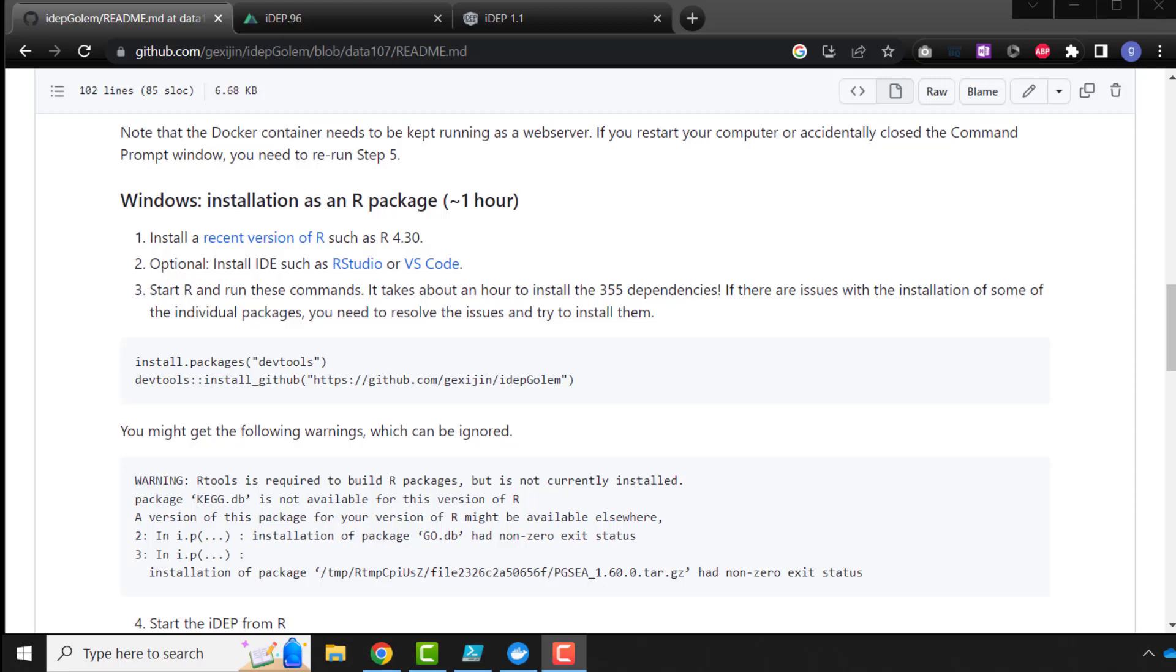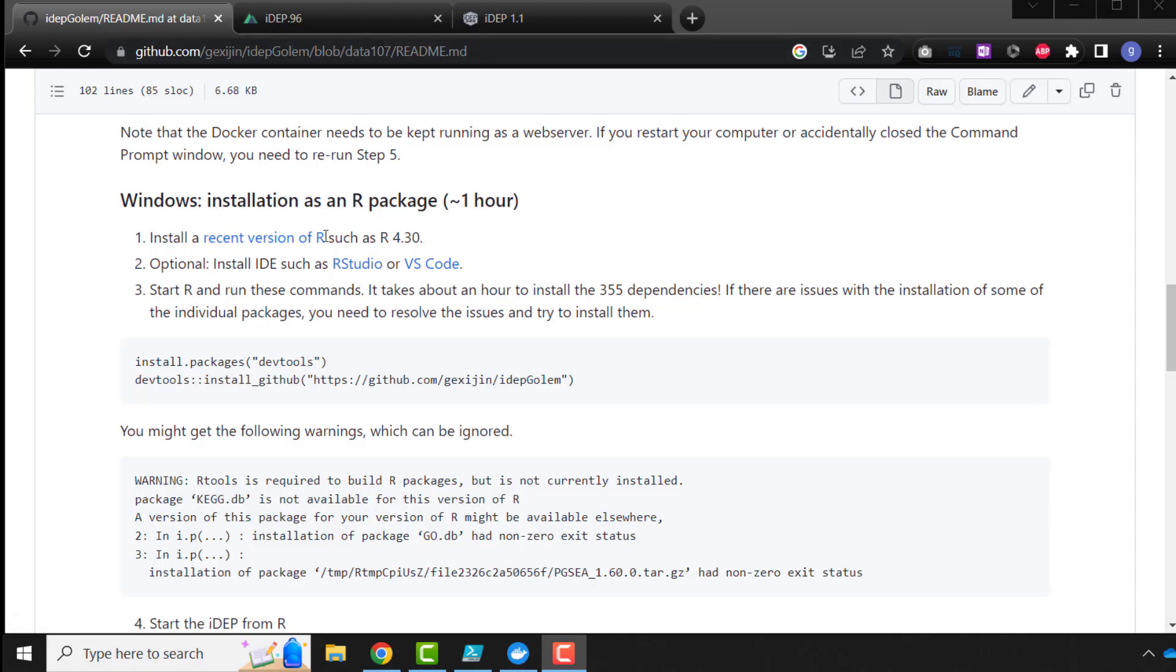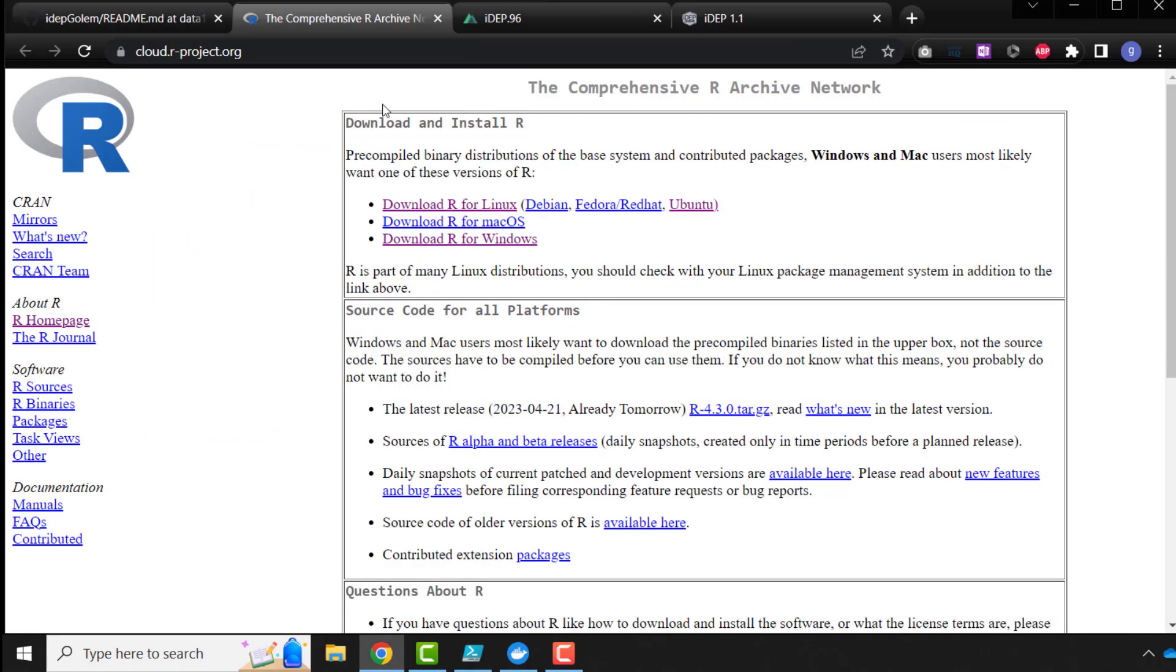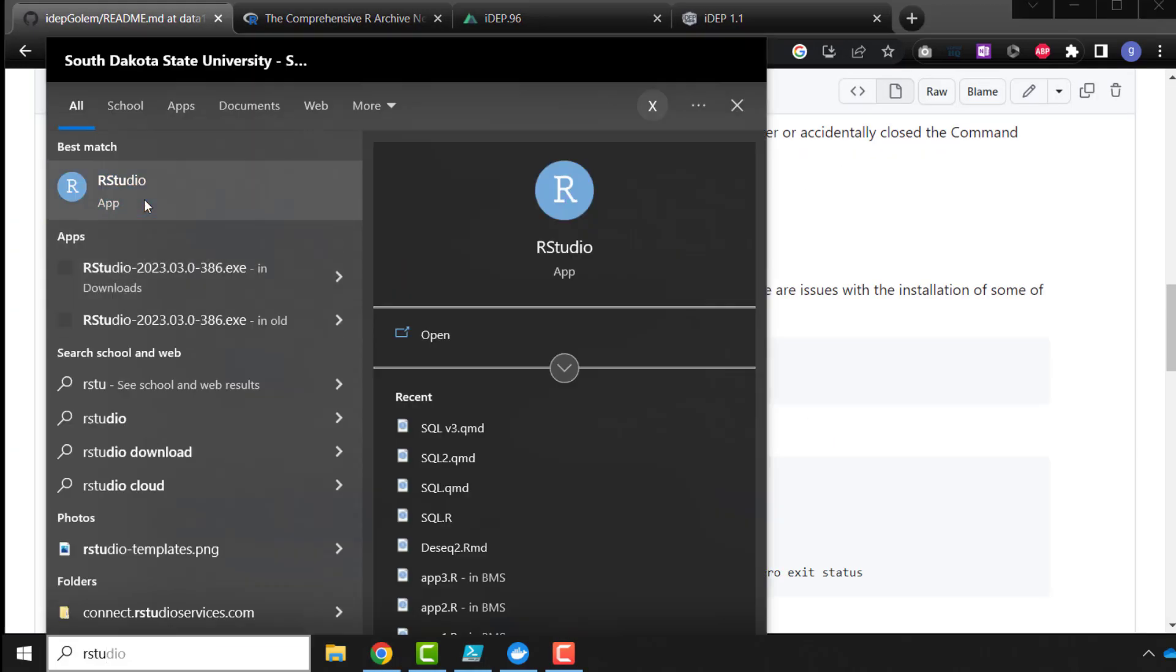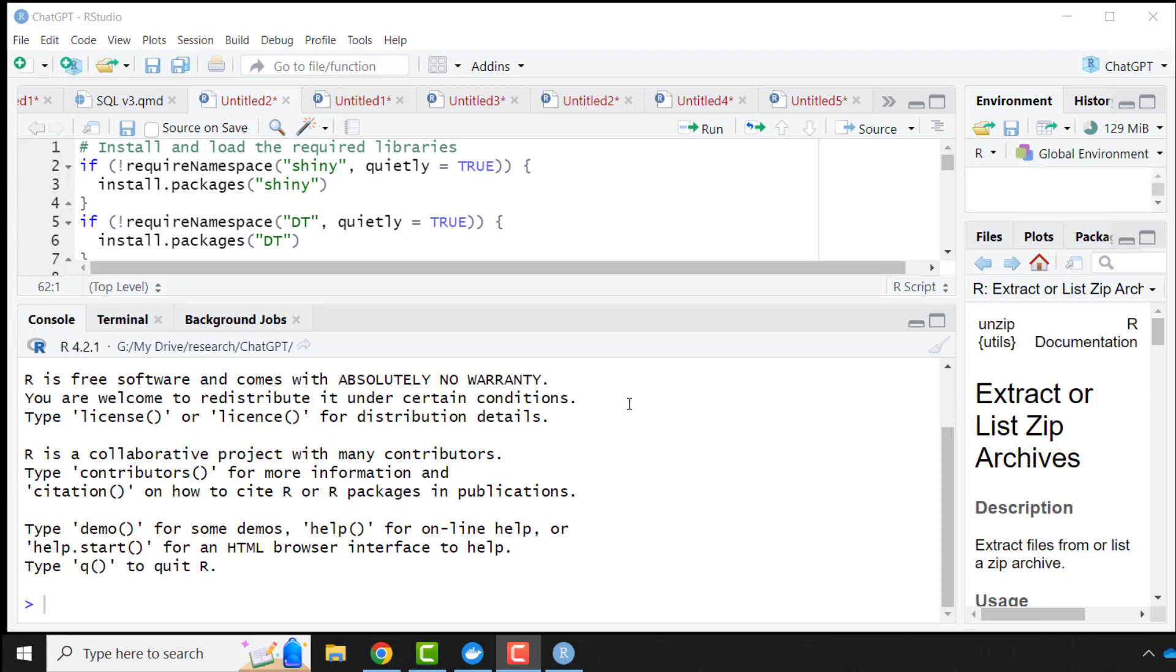Another method of installing ADAPT is, on Windows, to just install it as an R package. Follow the steps in here. Make sure you have the most recent version of R. It is version 4.3.0. I'm going to start R Studio. Okay, R Studio is started.